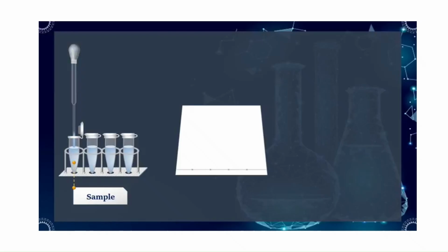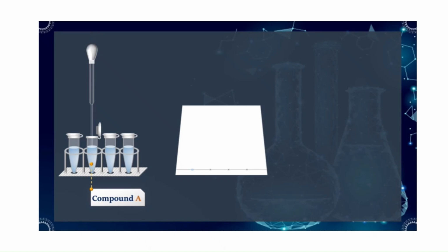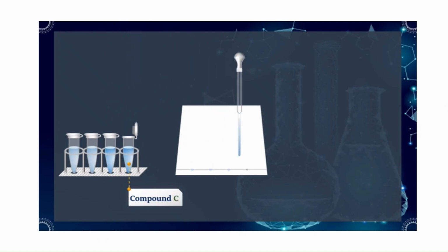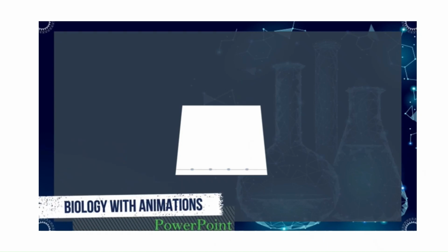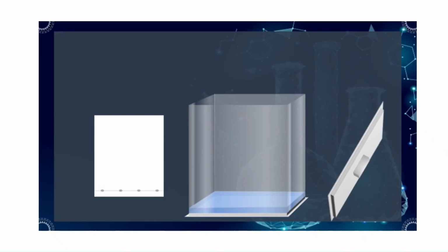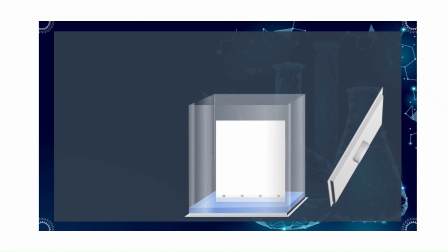Now I will show another video by which you can easily know how the TLC works. Here the sample has been applied on the TLC plate. It's a very important step because without sample application we cannot do the TLC procedure. We have to apply a very small amount.